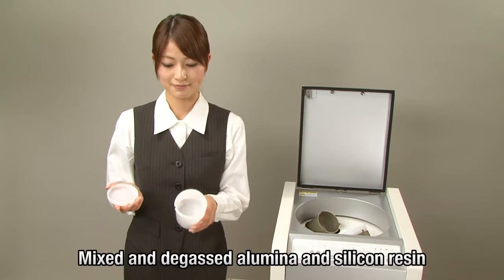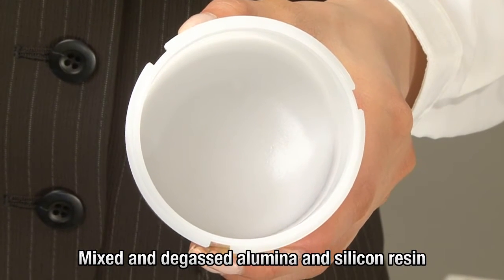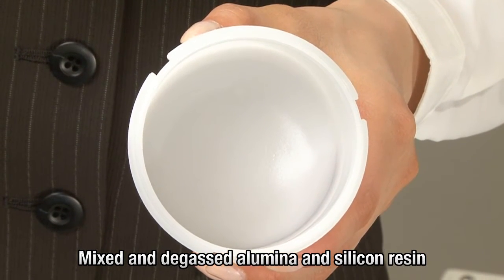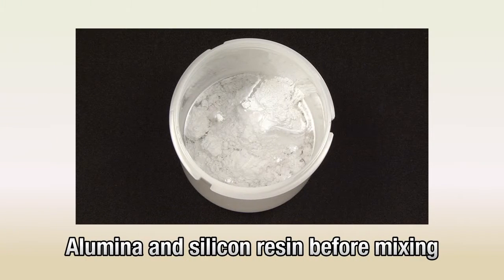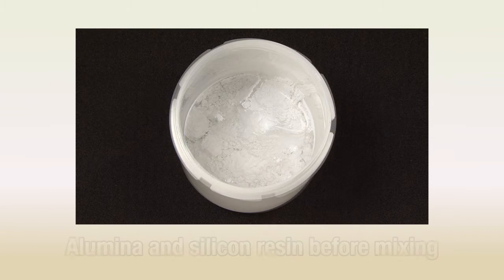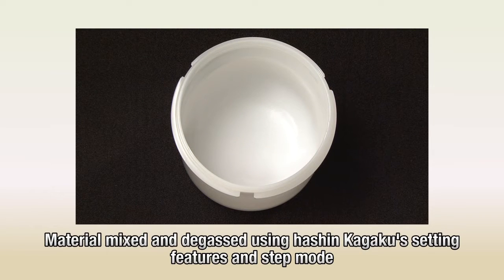See for yourself — two-step processing has successfully mixed and degassed the materials. Typically, when mixed with resin, powders form lumps that are hard to break up. But with separately set revolution and rotation speeds and step mode operation, this product prevents lumping and thoroughly mixes and degasses the materials.